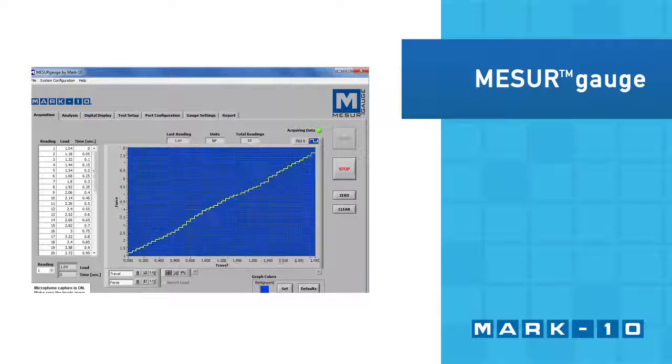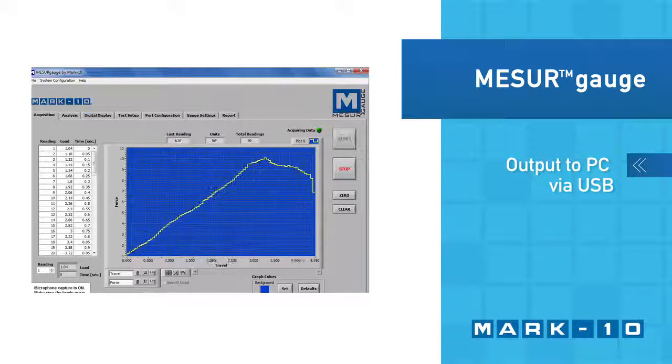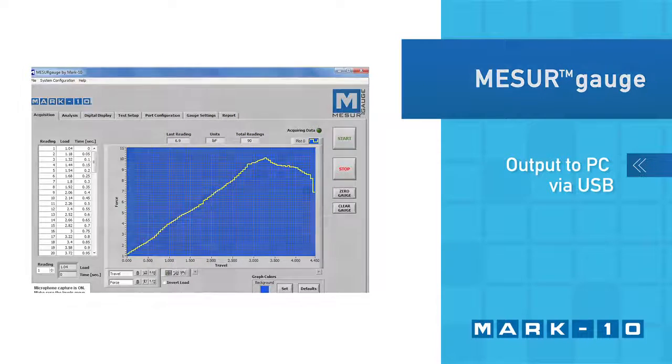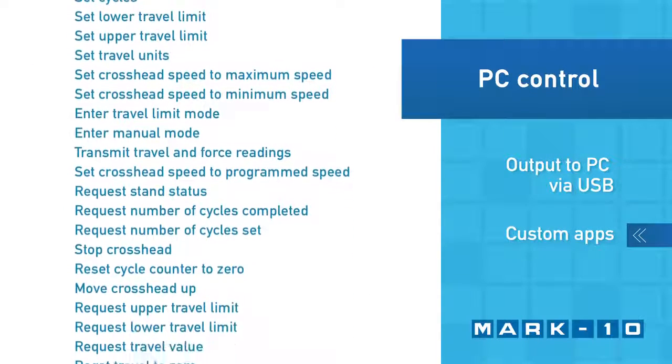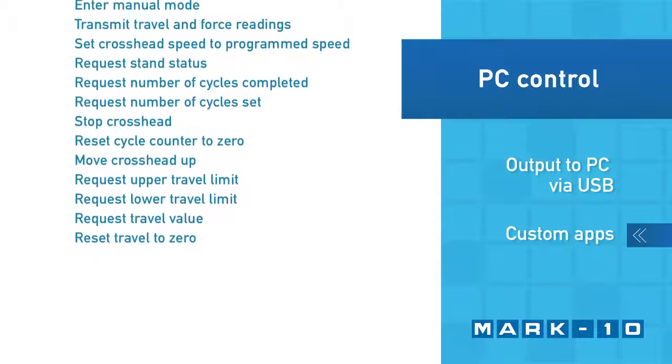Force and distance data can be output to a PC via USB for graphing and reporting. Custom applications can also be developed utilizing the ESM-303's ASCII command set.